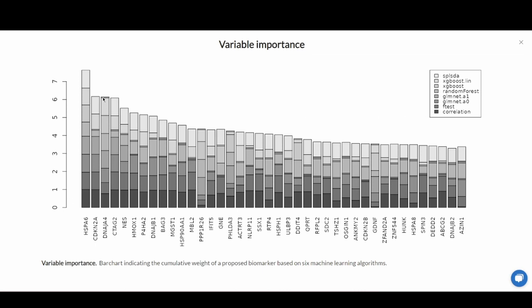This produces cumulative scores of the variable importance. Here you can see that the two most prominent biomarkers based on the combination of approaches are heat shock protein A6 and CDK-N2A.